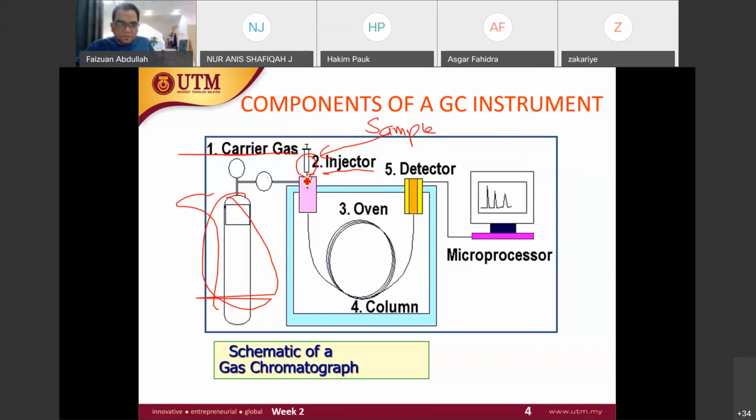And in the video, you have seen the temperature that is introduced into the sample injector here. The oven, am I true? Yes. To heat, yes, thank you. Why do we need to heat the sample that is introduced into the gas chromatography? Can anybody tell me?